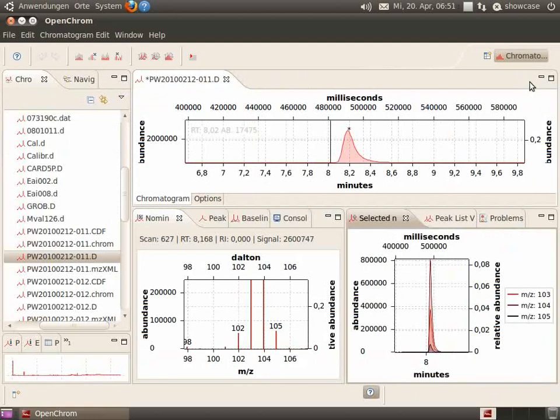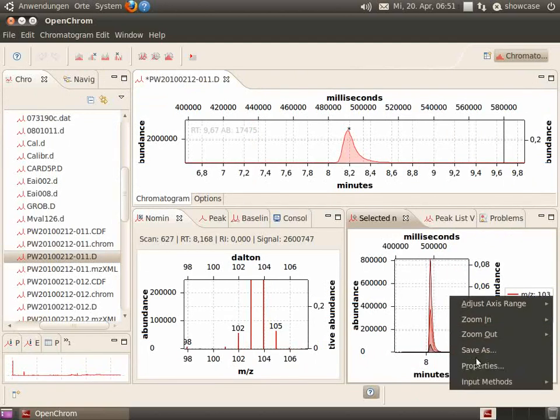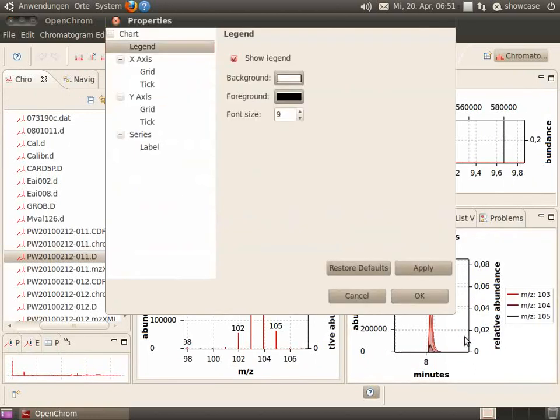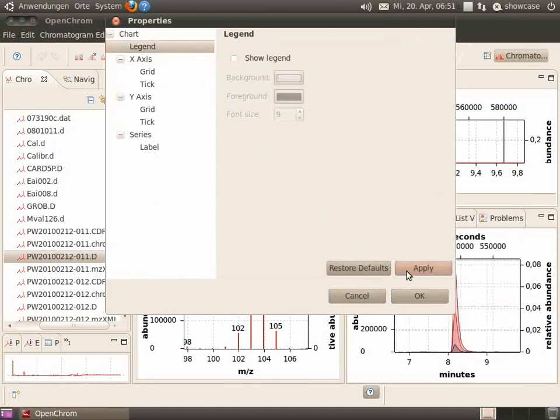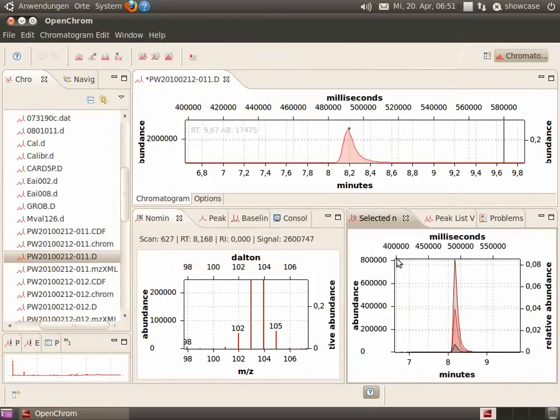Because it's very small, we'd like to deactivate the legend. Apply and say OK.